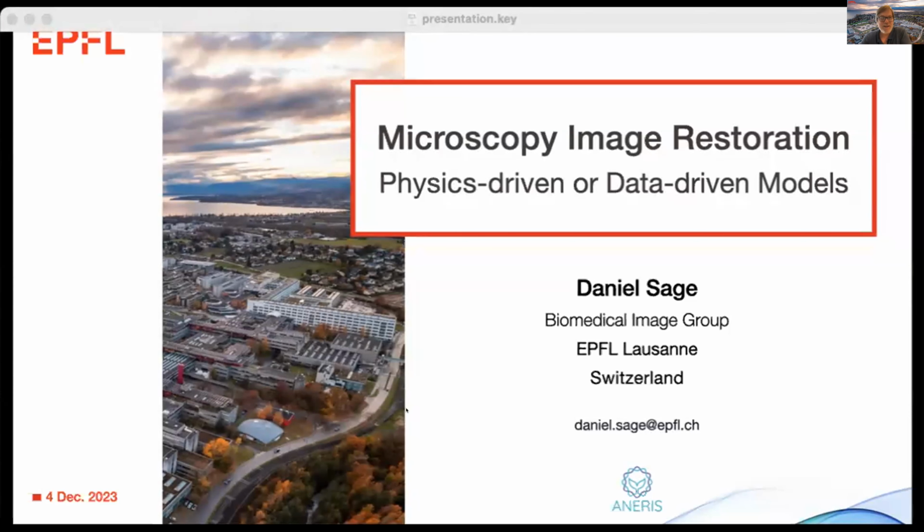in marine biology. Image restoration is a very broad topic. I cannot cover everything, but I will present the most common operations in microscopy, which are denoising and deconvolution. And at the end, I would also like to discuss the two paradigms that we are facing now, the physics-driven method and the data-driven method, that Tali also spoke about a little at the end. And effectively, the emergence of AI is starting to completely redraw some aspects of our field and the way that we design image restoration.